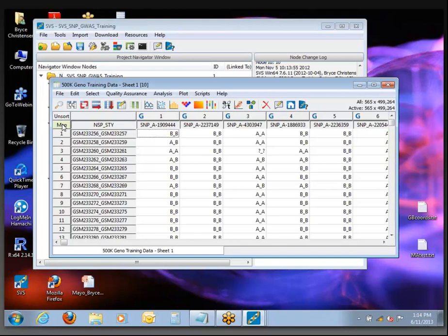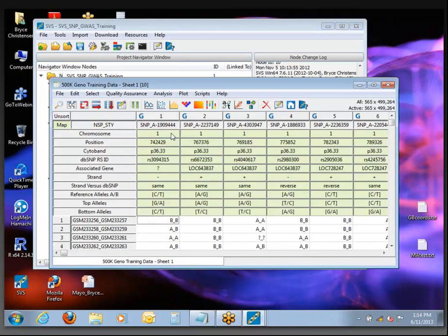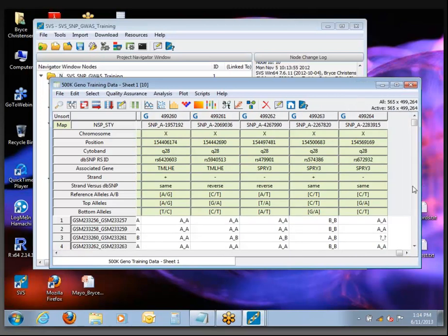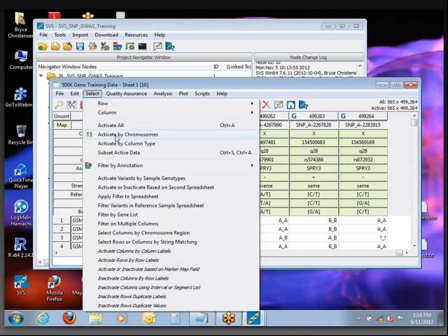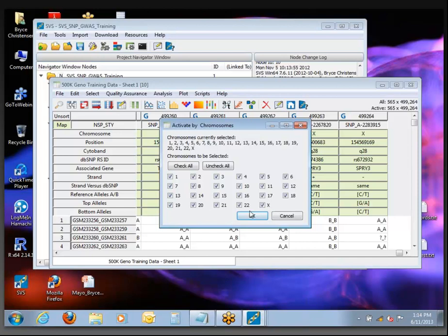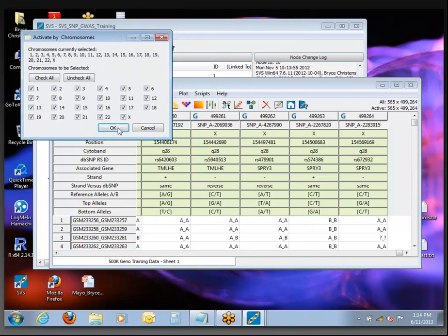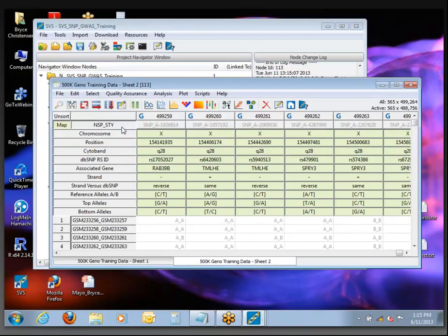If you click this little green Map button, you see all of the marker map information including on the first row the chromosome. We can use that to inactivate or activate particular chromosomes. So if I want to turn off X, I would come to the Select menu and use the option to Activate by Chromosomes — very straightforward. This opens up a selector showing everything present in the data. Simply uncheck X and click OK. You'll see immediately that all of those columns on the X chromosome are grayed out — inactive, they won't be used.